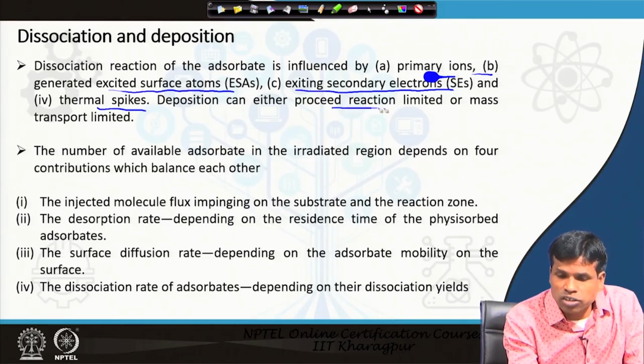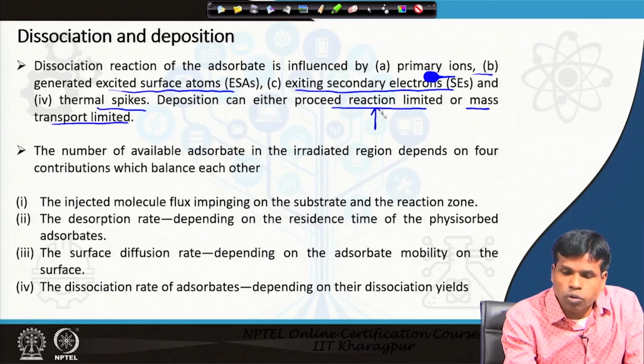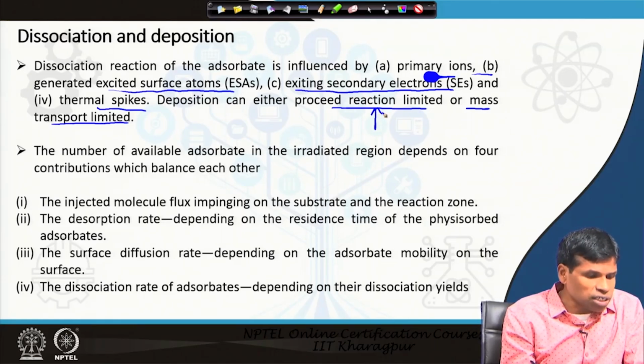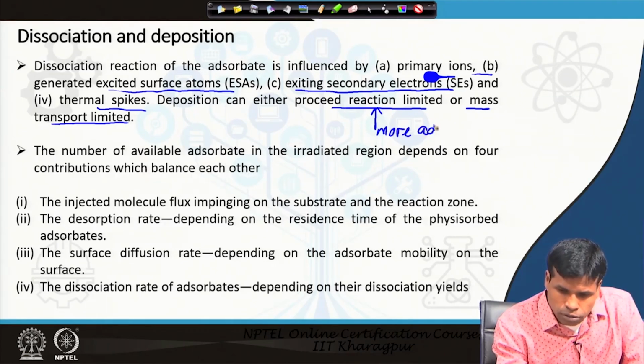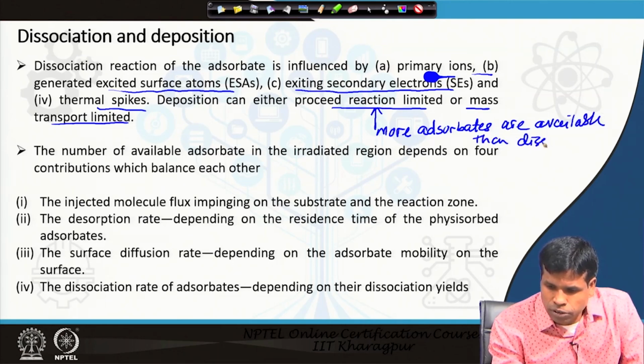Deposition can be either reaction limited or mass transfer limited. It is reaction limited when more adsorbates are available than dissociation.